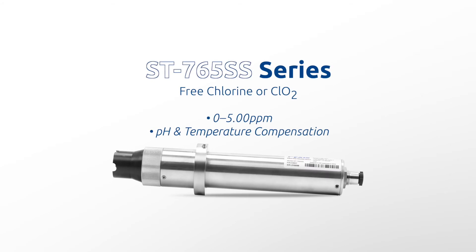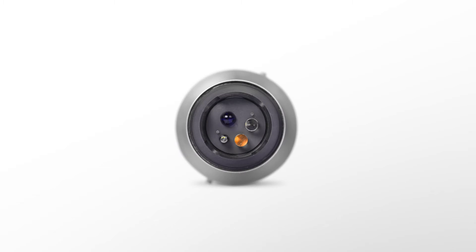The DW2100P panel also incorporates the newly released Pixis ST765SS series sensors. The ST765SS series are stainless steel multi-parameter non-membrane sensors based on unique electrochemical principles to determine free chlorine or chlorine dioxide, pH content, and temperature in water with a range of 0.00 to 5.00 ppm. These sensors incorporate Pixis' advanced technology in the field of bare gold electrochemical detection and are offered in two formats, both capable of performing temperature and pH compensation for the measurement of free chlorine or chlorine dioxide based on real-time conditions present in the application of use.